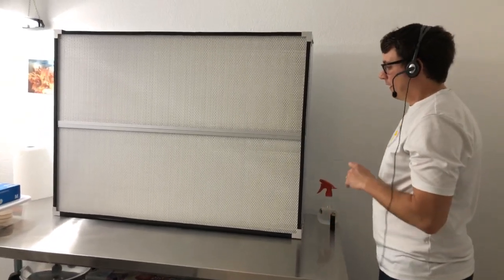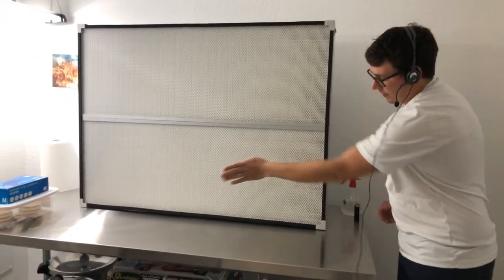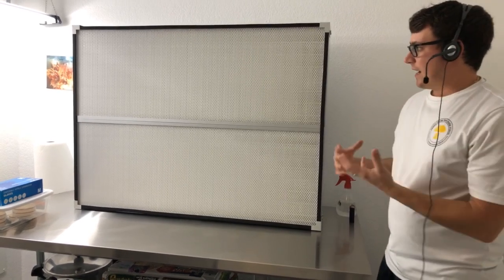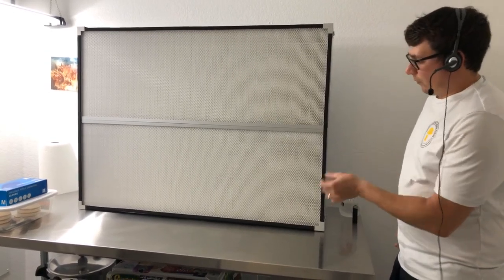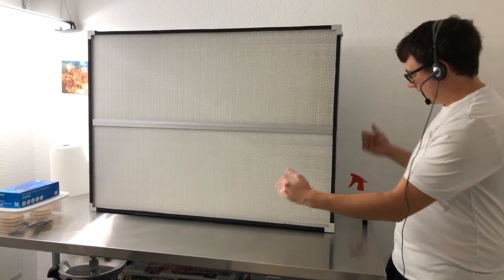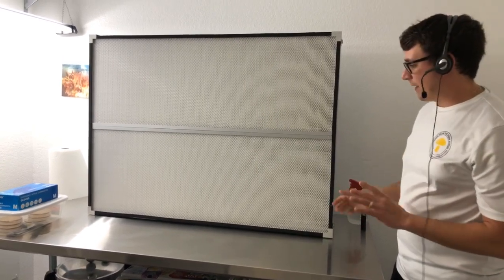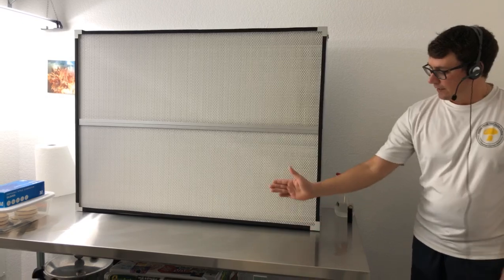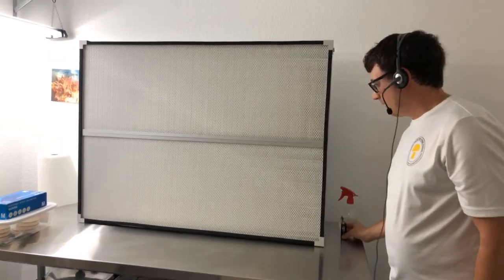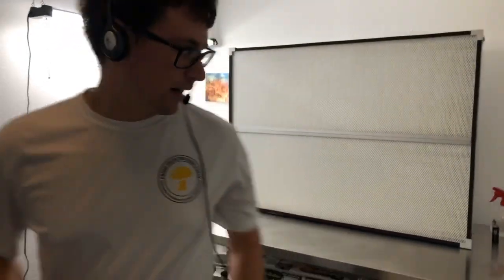One of the most important things when working in front of a clean space is that you don't have any weird turbulent angles from the air. To do it scientifically you would need a wind gauge and a manometer, which detects the difference in air pressure from the chamber to outside the flow hood. I don't have those tools, but just looking at the pattern of the alcohol evaporating and using the flame from the lighter, it seems very stable.